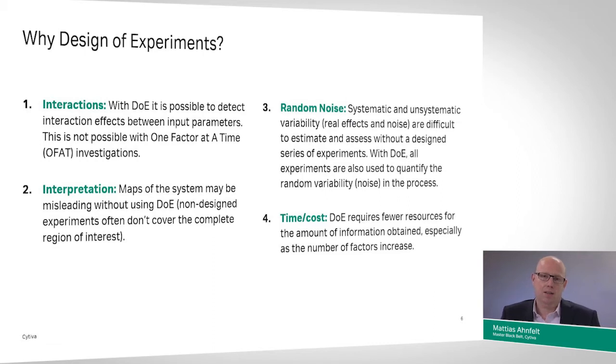And finally, this all boils down to the fact that, if we look at it from a time-cost perspective, design of experiments really requires a minimum amount of resources considering the amount of information and knowledge that is built into our process development efforts. And this is especially true when the number of input parameters and process parameters increases.